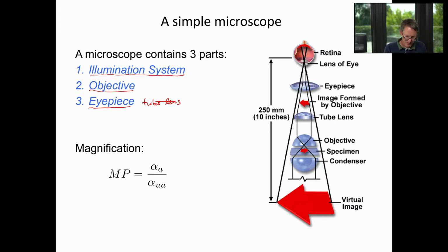So what we have is a light source that you see down here. And then there's a condenser lens, just like in Hooke's microscope that you saw in the previous lecture. In Hooke's microscope, the condenser was that little water-filled glass bulb that just acts as a lens to throw the light from the candle onto the little sample containing pin, as you've seen. But here, it's a lens that obviously does that, and it throws the light onto the specimen, shown here by a little red arrow. And then you have the objective lens.